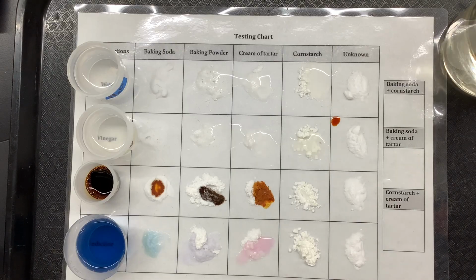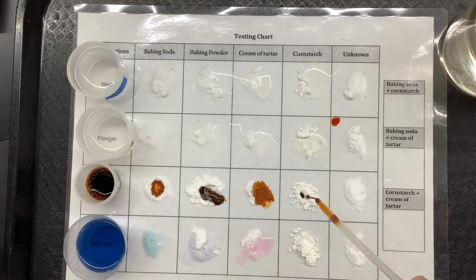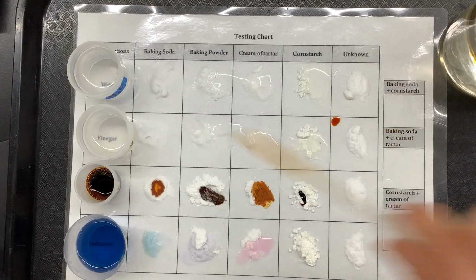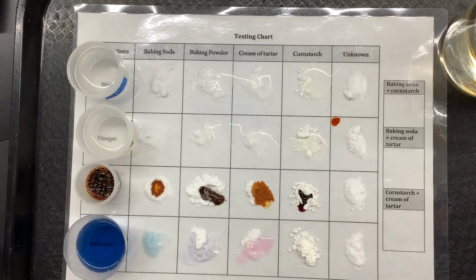Let's rinse out the dropper and the rinsing beaker. Oops. Okay, iodine. Wow, look at that one, kind of changed color. Very dark. Okay, that's like black and red. No bubbles forming for iodine and cornstarch. All right, almost done.